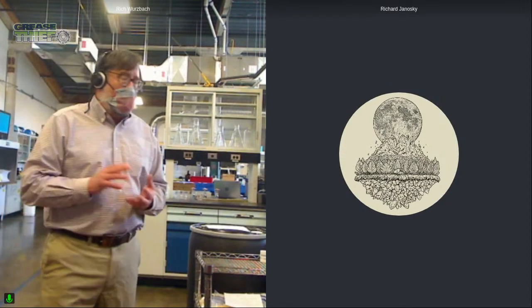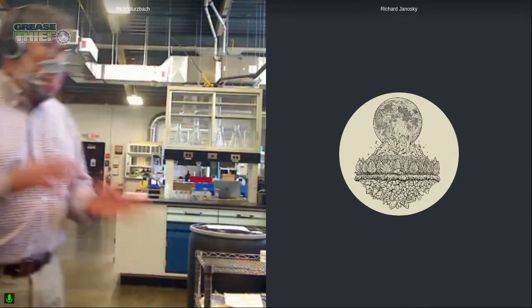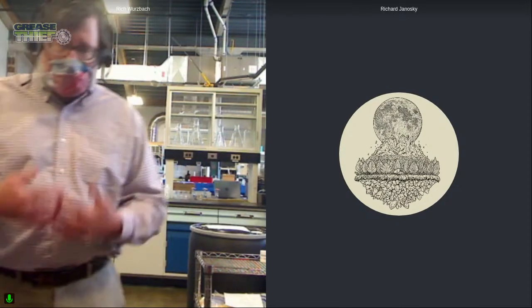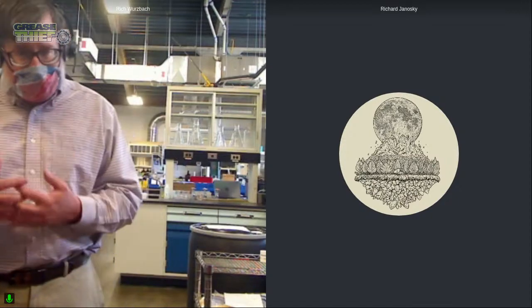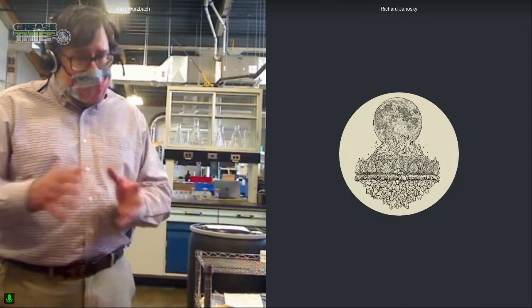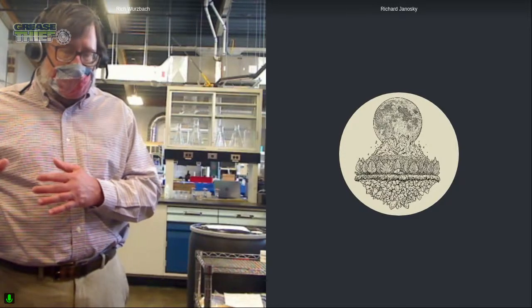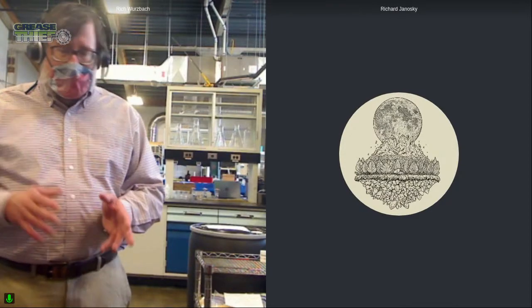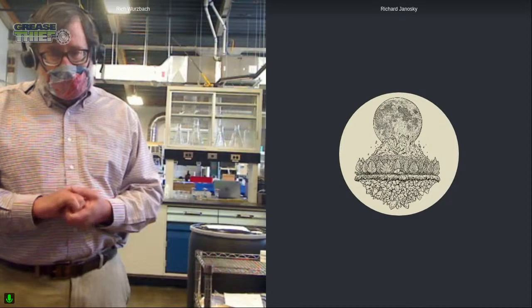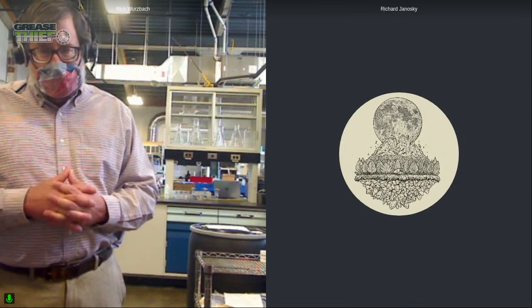I would think what I would want to avoid, and maybe this is Mindy's point, is that you wouldn't want to sometimes wait 6 hours and sometimes wait 24, or vary it out. You'd want to create within your laboratory, or if you're in the field doing this, some repeatable approach to this, but recognizing that if you do it right away, there is this time of solvency that needs to be acknowledged and recognized, and being consistent is very important, but also giving some reasonable period of time for most grease formulations that we've encountered to allow the majority of those antioxidants to get in solution and be available for testing. Is that helpful?